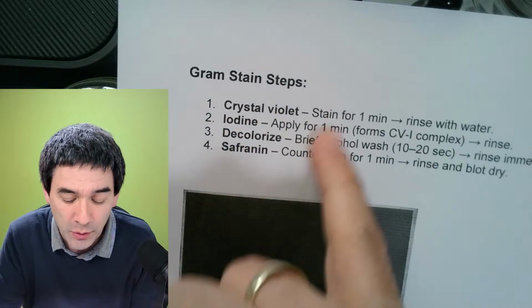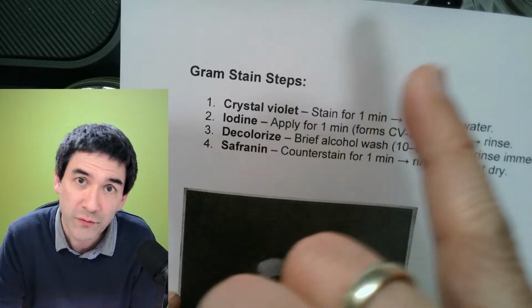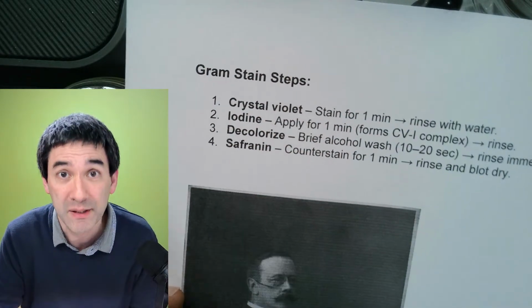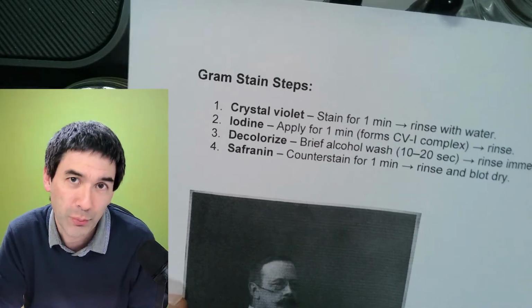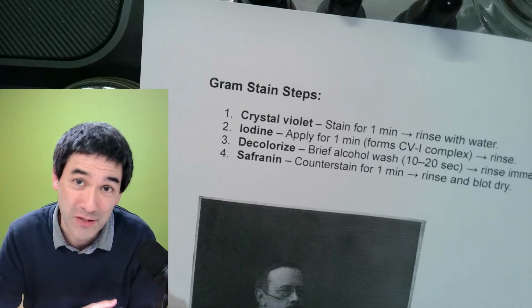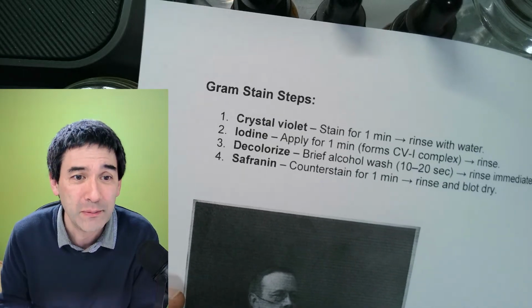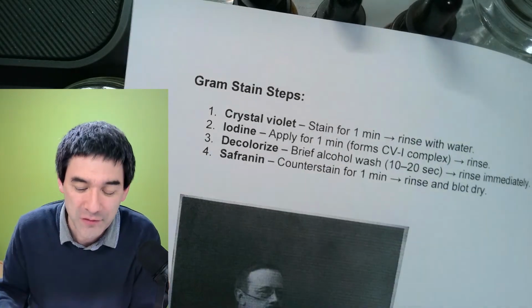Okay, and what I'm going to do is explain to you first, for the next couple of minutes, what actually happens, because I think that's also important. After all, we're doing this live stream because you want to learn something. I want to learn something as well, because I also had to experiment around a little bit on getting this optimized for the live stream.